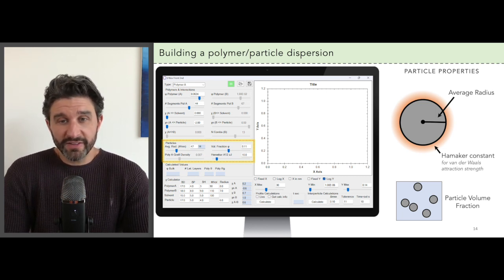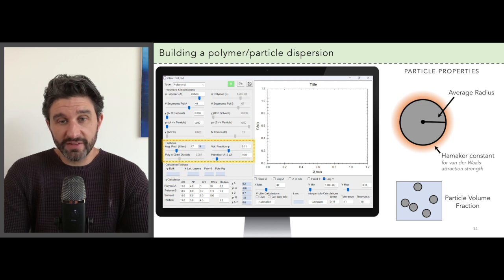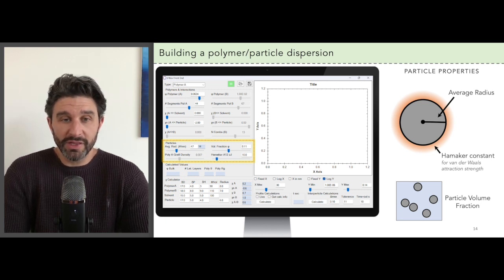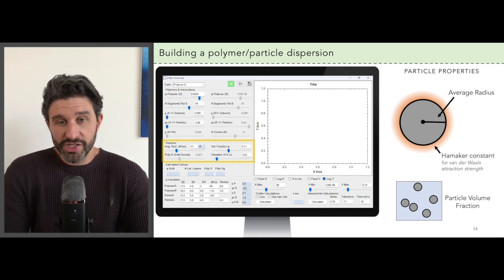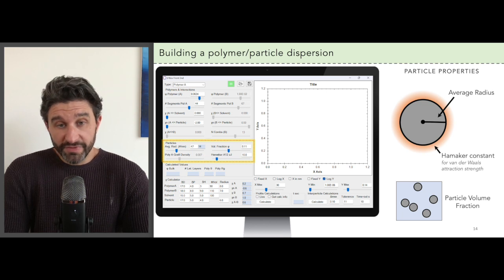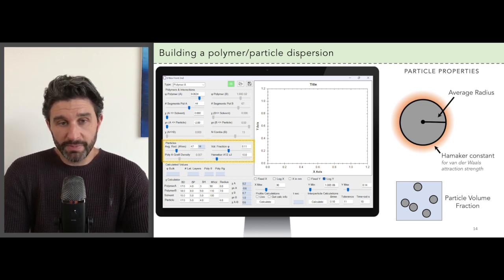You also specify in this section the Hamaker constant, which dictates the van der Waals attraction strength between the particles when they're unshielded by the polymers. And finally you can choose the volume fraction of the particles.